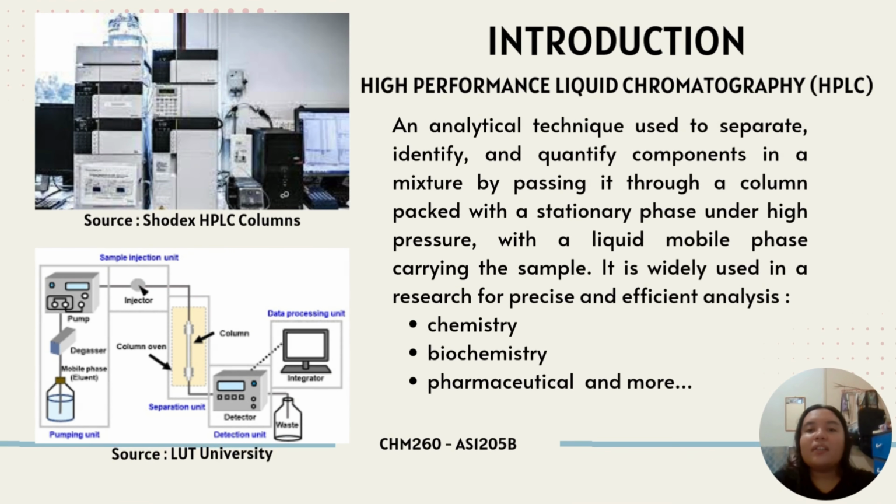Before we start, what is high-performance liquid chromatography, known as HPLC? High-performance liquid chromatography is an analytical technique used to separate, identify, and quantify components in a mixture by passing it through a column packed with a stationary phase under high pressure, with a liquid mobile phase carrying the sample. It is widely used in research for precise and efficient analysis, for example, in chemistry, biochemistry, pharmaceutical, and more.